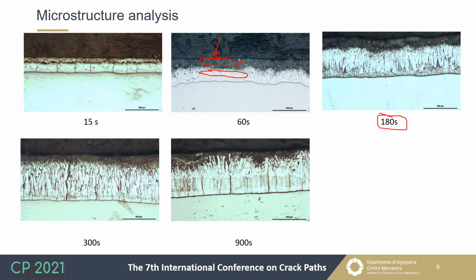Increasing the dipping time, you can see that the zeta phase is well developed, and the specimens characterized by 300 and 900 seconds of dipping time are characterized by high values of the thickness of the zeta phase.